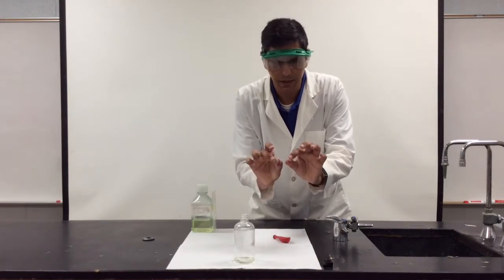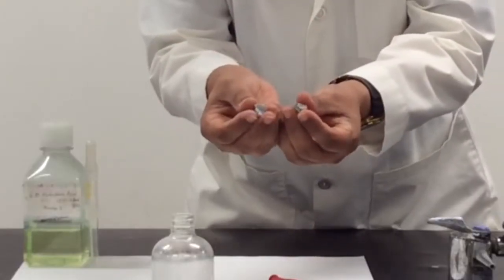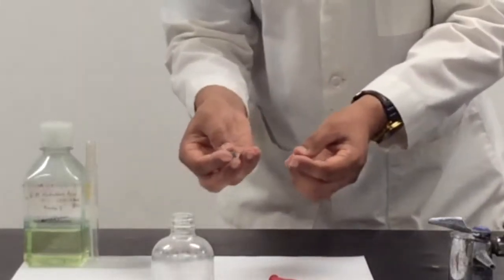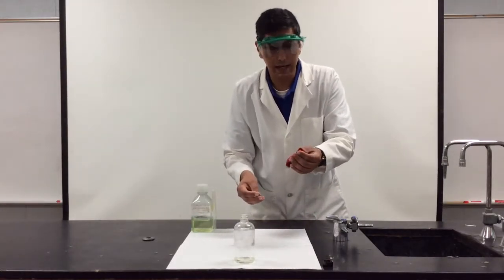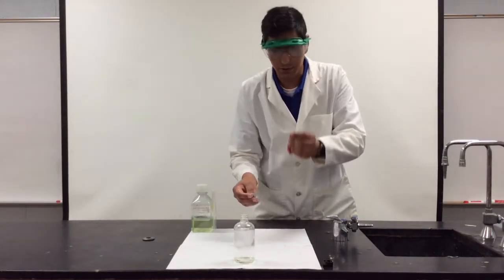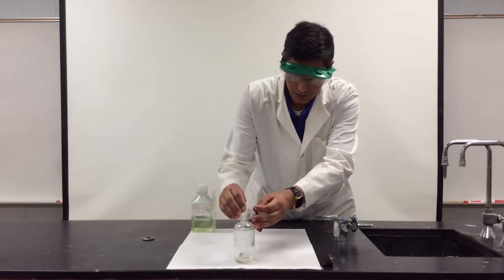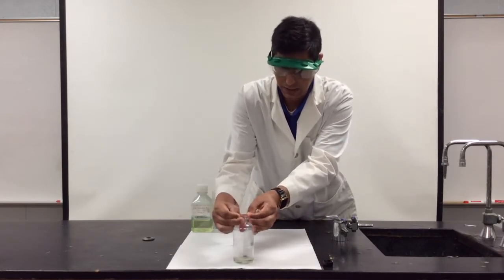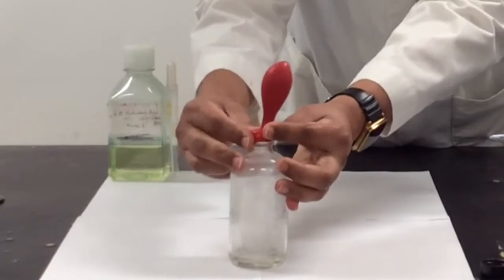We can see the metal here. It's very shiny. It's a shiny metal quite reactive with the acid and I want to try to collect that gas with this balloon. So I'm going to very carefully cap this with the balloon.